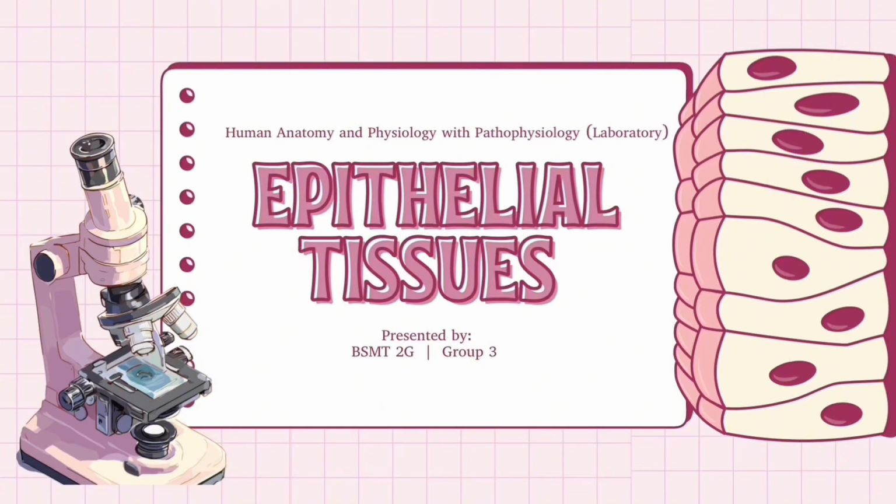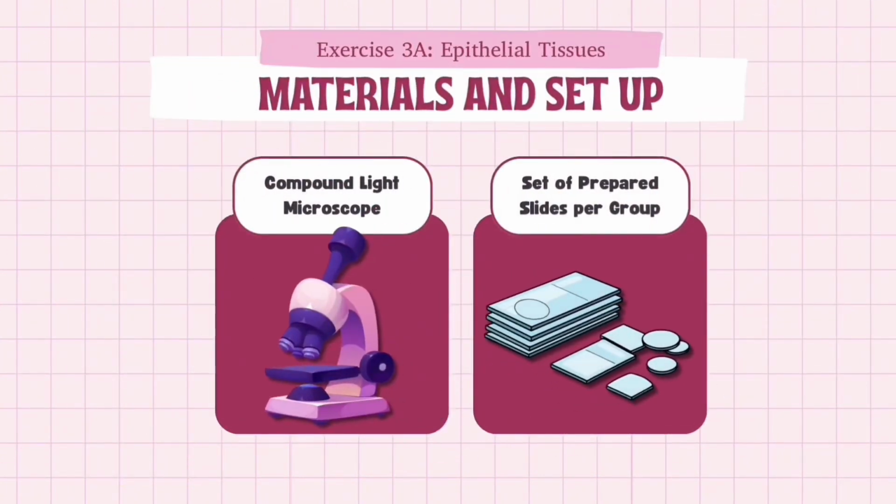Epithelial tissues are also among the easiest and most important structures to identify under the microscope because their appearance, whether flat, cuboidal, columnar, simple, or stratified, tells us a lot about their function. In our laboratory activity, we examined several epithelial tissue slides, each showing different characteristics and adaptations. Before discussing our observations, let us first review the materials, setup, and procedures used in viewing these epithelial samples.